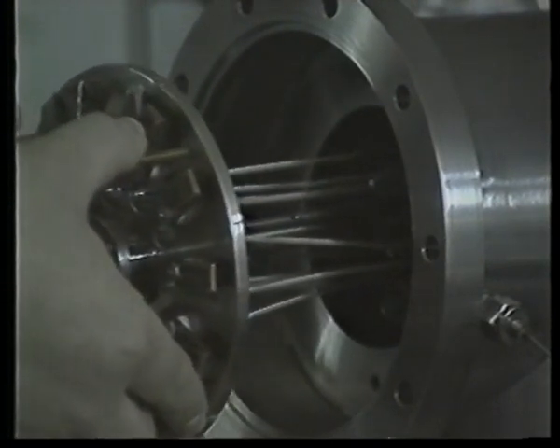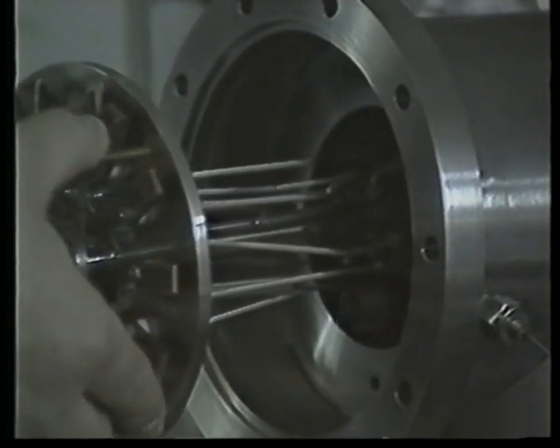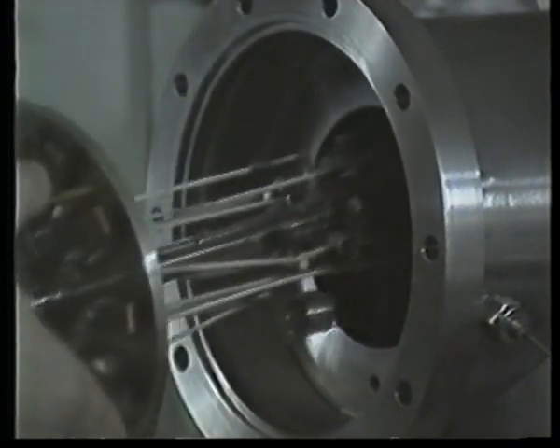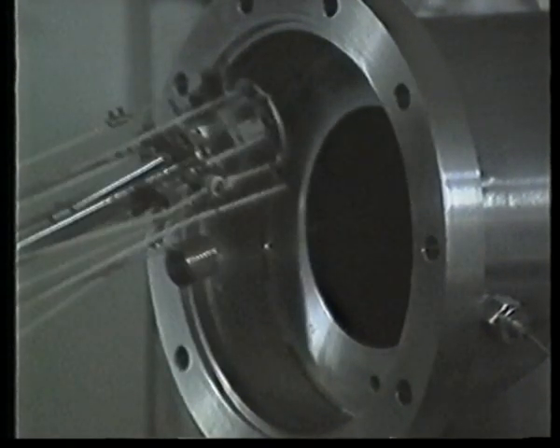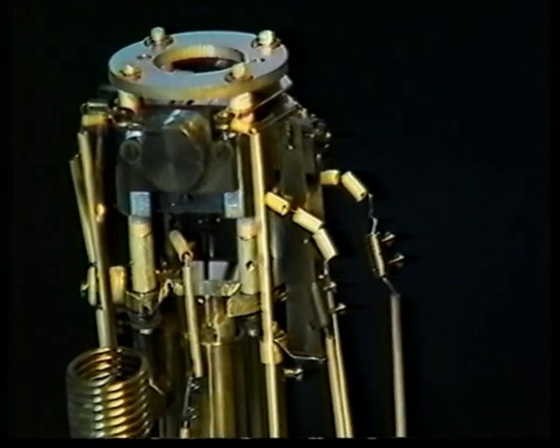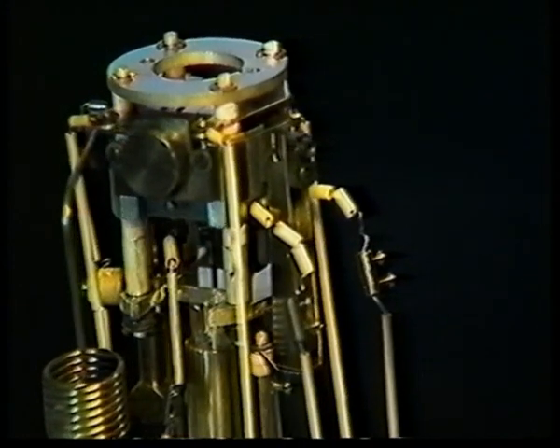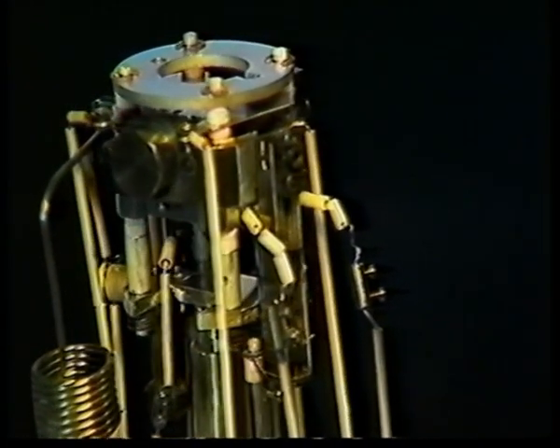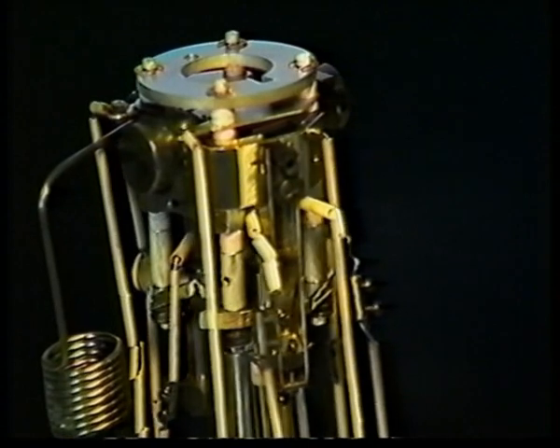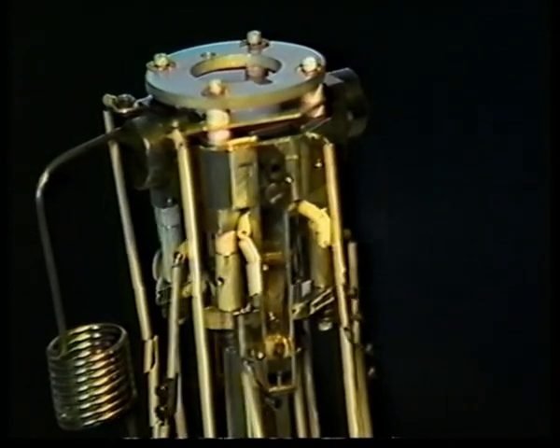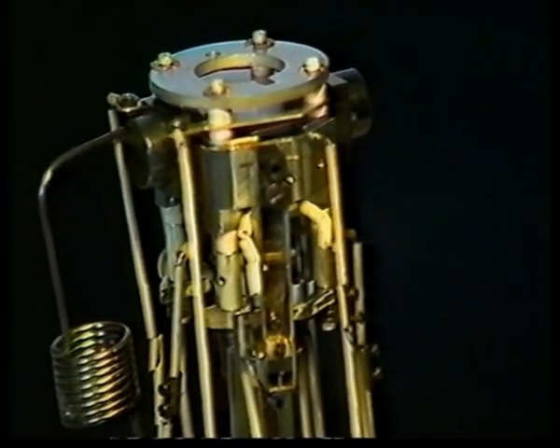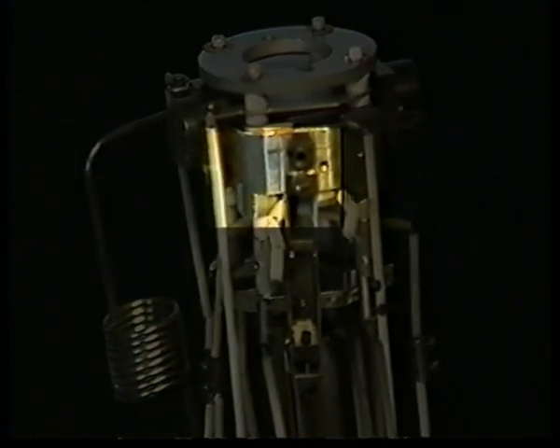Samples can vary enormously in type and may be elements, mixtures, or compounds. And their state may be solid, liquid, or gaseous. So the source has to be capable of producing ions from these many different types of sample which may need to be analyzed. You can see here the source fully removed and upright so that it can be seen in more detail. The electrodes look complex but are many and varied in order that the different types of sample can be handled and analyzed.